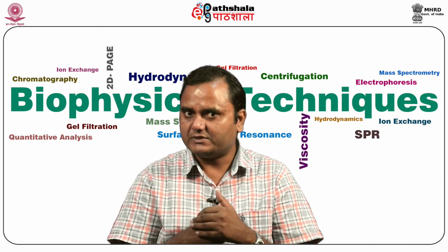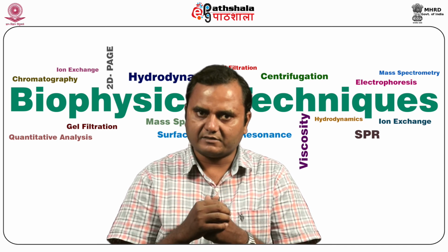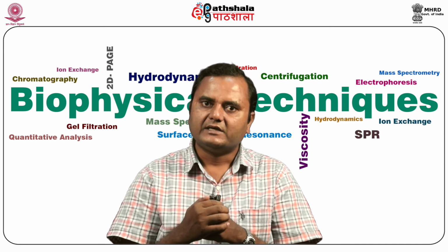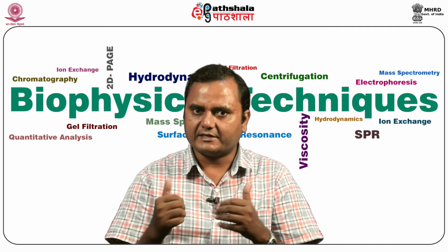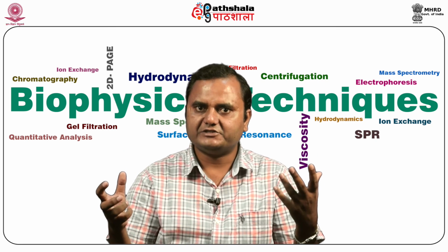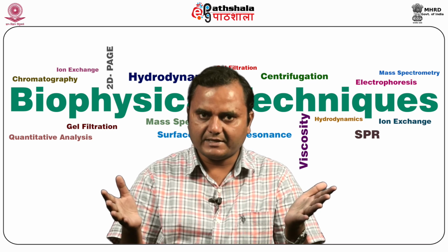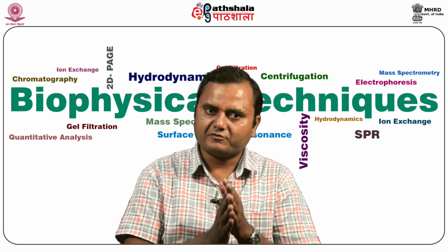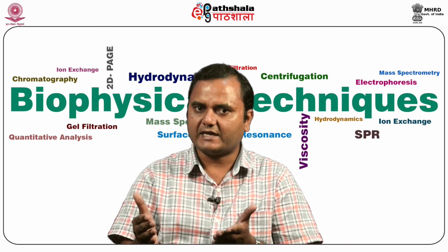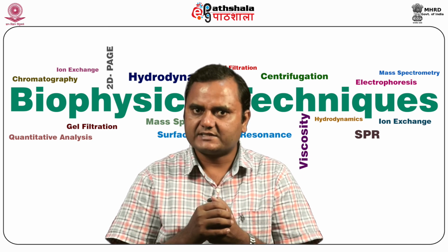Then it can be utilized for the assembly and disassembly of biological macromolecular complexes. For example, if a complex is formed in a certain condition, then you can easily analyze what conditions are capable of forming such a complex, how big the complex is, what the components of the complex are, what the monomers and dimers are, and what the basic components of that complex are.